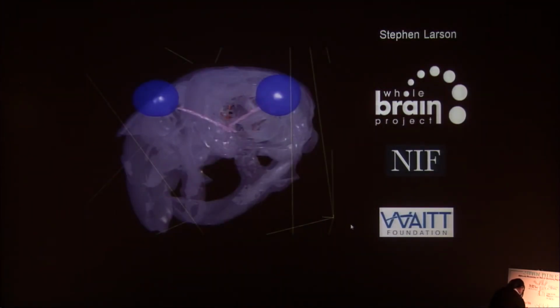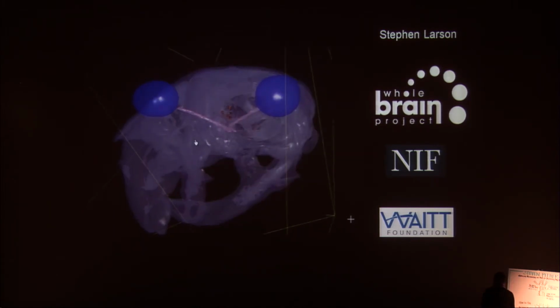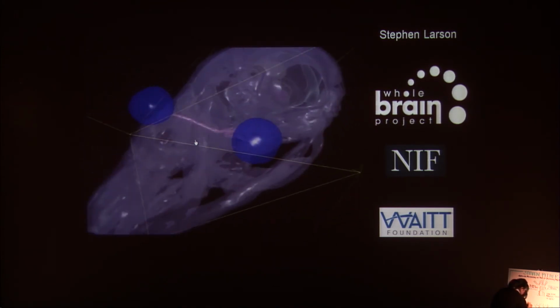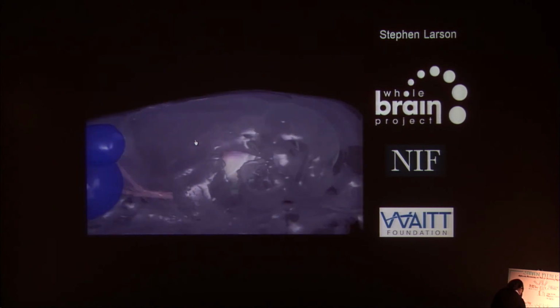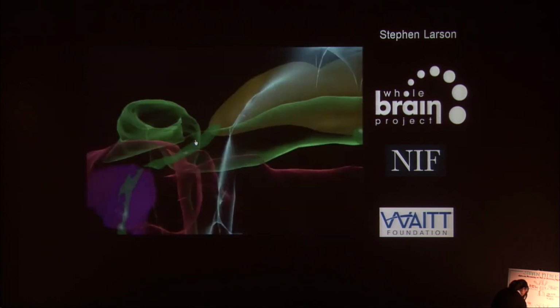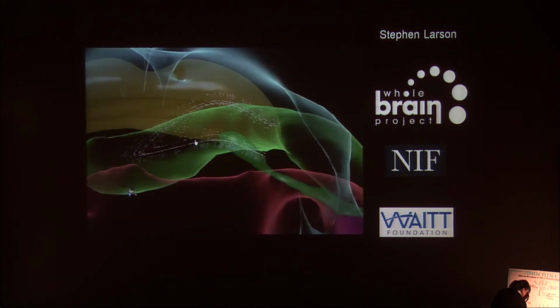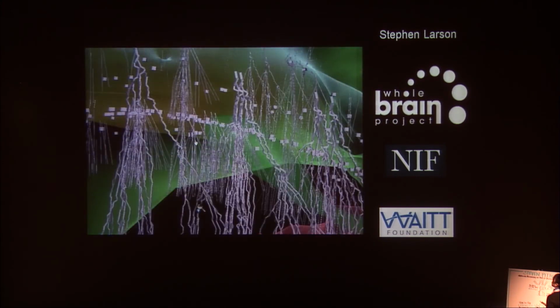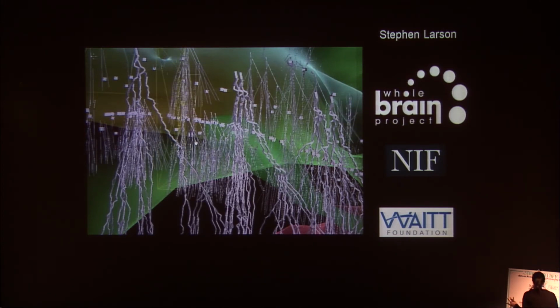Now, in addition to developing scalable technologies for image segmentation, we're also developing interactive 3D environments for how you take the models that are generated through these efforts and combine them with data that comes from other imaging modalities, data acquired at other scales of resolution, and also other knowledge sources that really root this data into a biological context, both spatially and semantically, and then allows you to do cross queries between the two. And this is really the vision of the Whole Brain Project that's championed by Stephen Larson in the group. And you're seeing a movie of a user interactively zooming down from the level of the mouse brain to an array of hippocampal neurons.